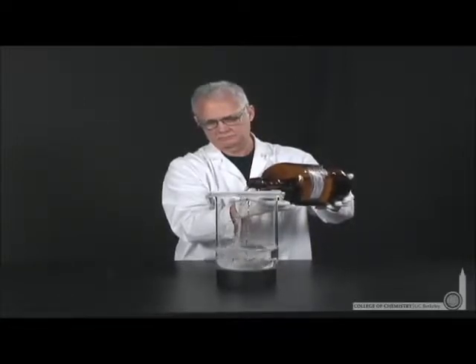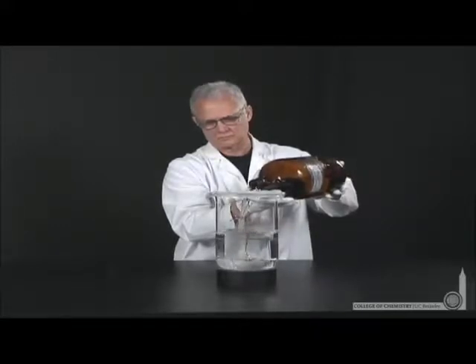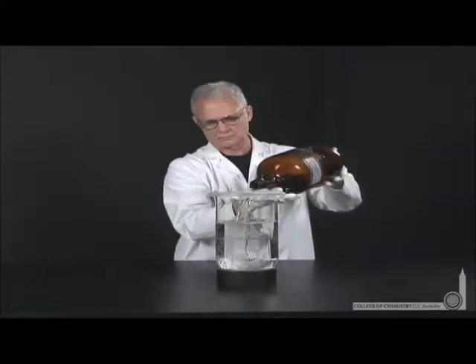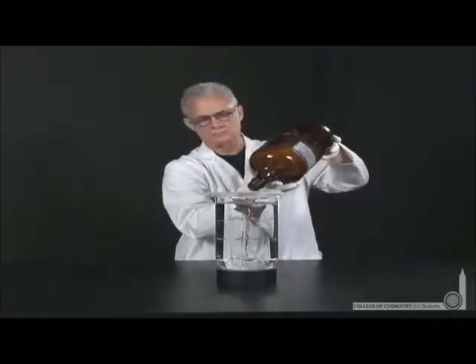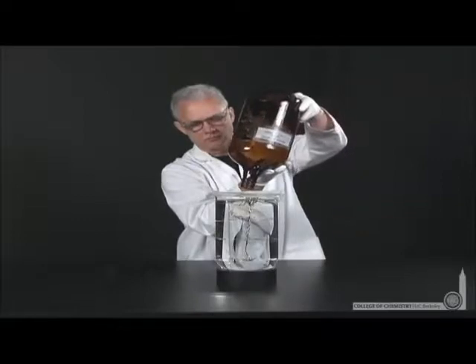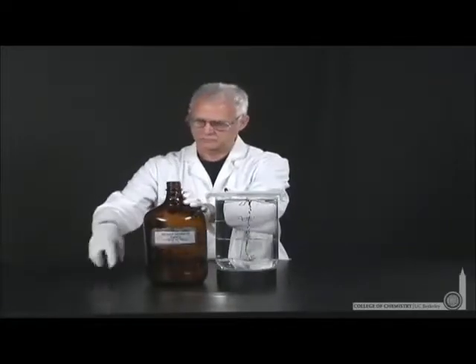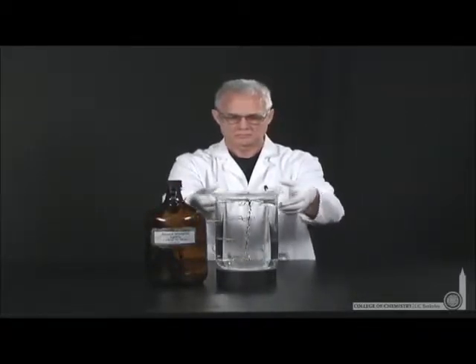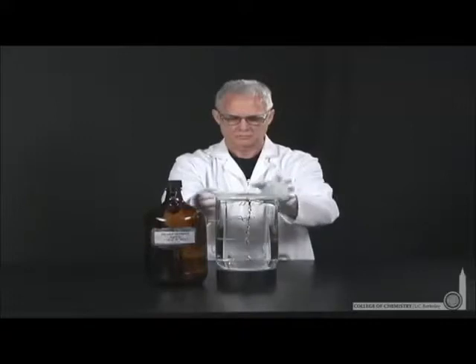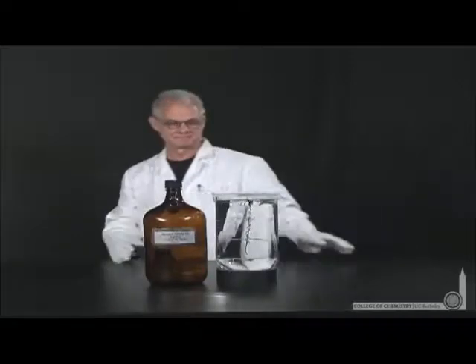Now, the reduction of silver ions to silver metal is higher on the reduction potential scale than copper ions to copper metal. So what we expect is the silver ions will be reduced while the copper metal will be oxidized to form copper ions. We'll expect silver to remove electrons from solid copper, forming copper ions, while simultaneously forming solid silver in this solution. The reaction actually takes quite a while, so Lonnie will seal it up and will do a time-lapse photography over the course of about 8 hours to watch the silver metal form.